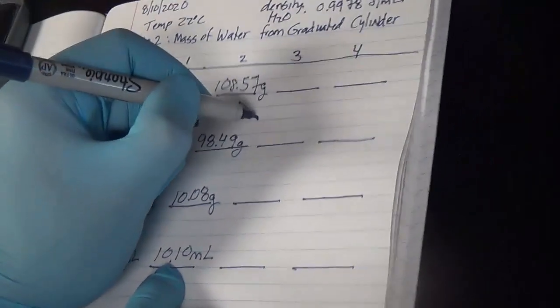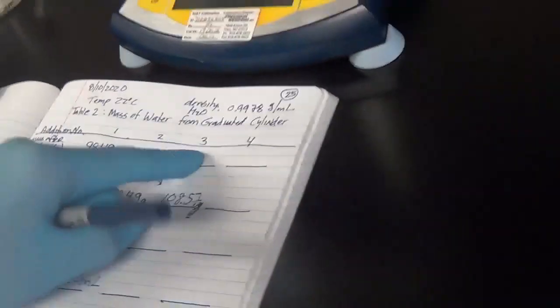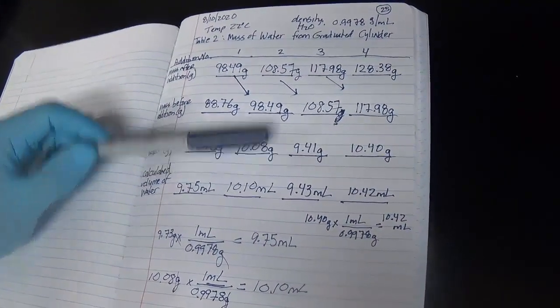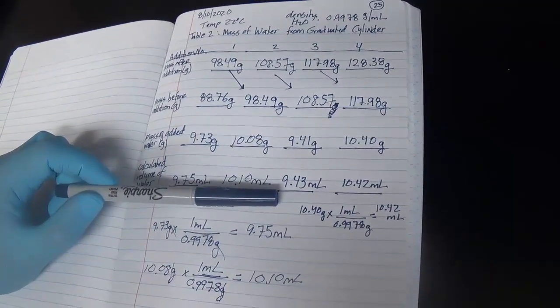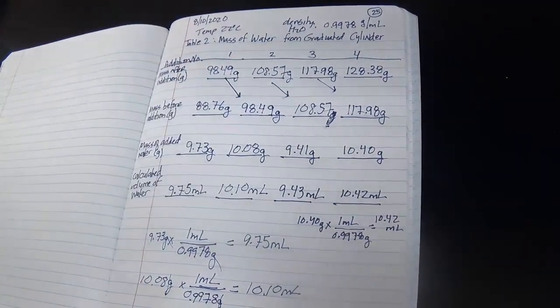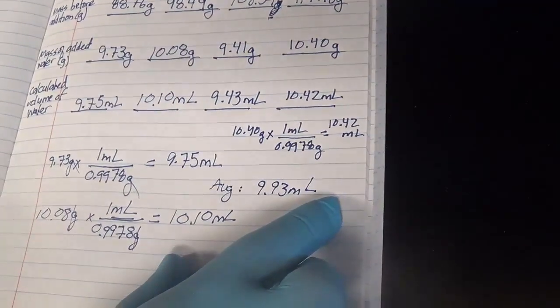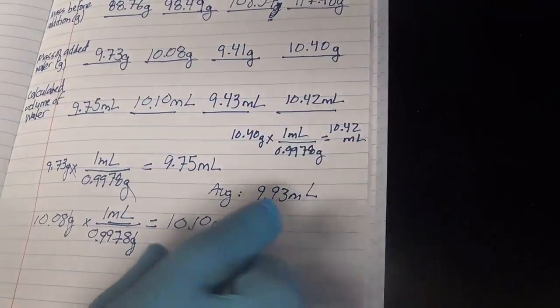For the third and fourth replicates with the graduated cylinder: the third 10 mils was 9.41 grams, giving 9.43 milliliters after dividing by density. The fourth was 10.4 grams, corresponding to 10.42 milliliters. Taking the average of all four measurements gives 9.93 milliliters. As part of the post-lab assignment, you need to report error — so it would be 9.93 milliliters plus or minus the standard deviation.